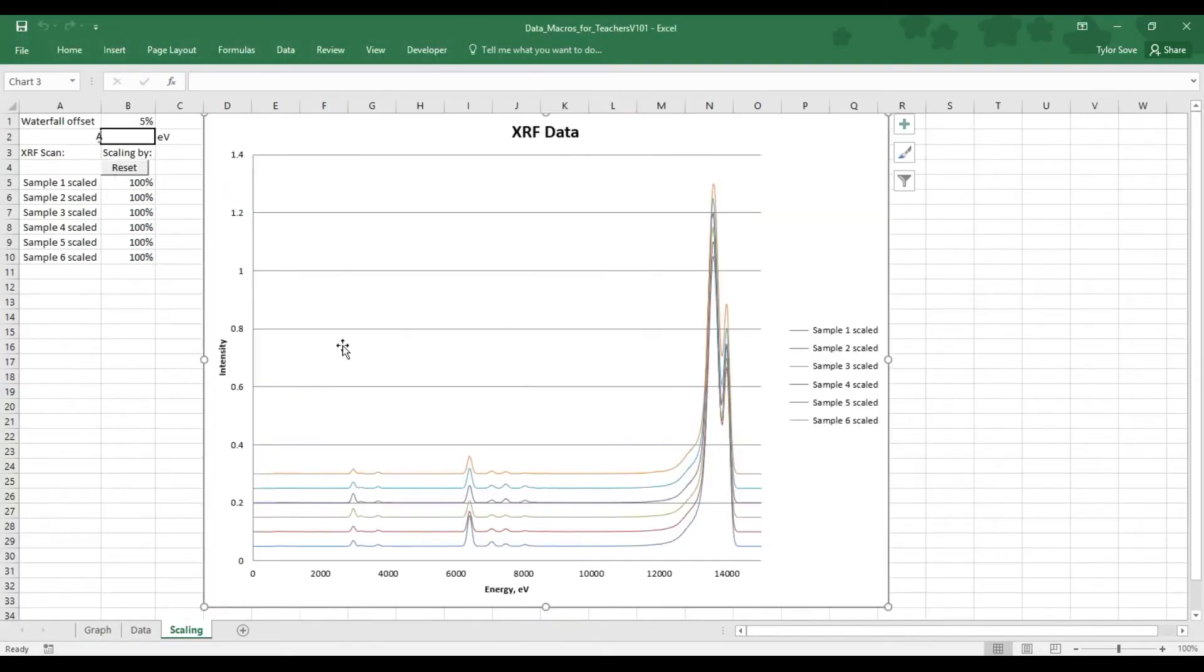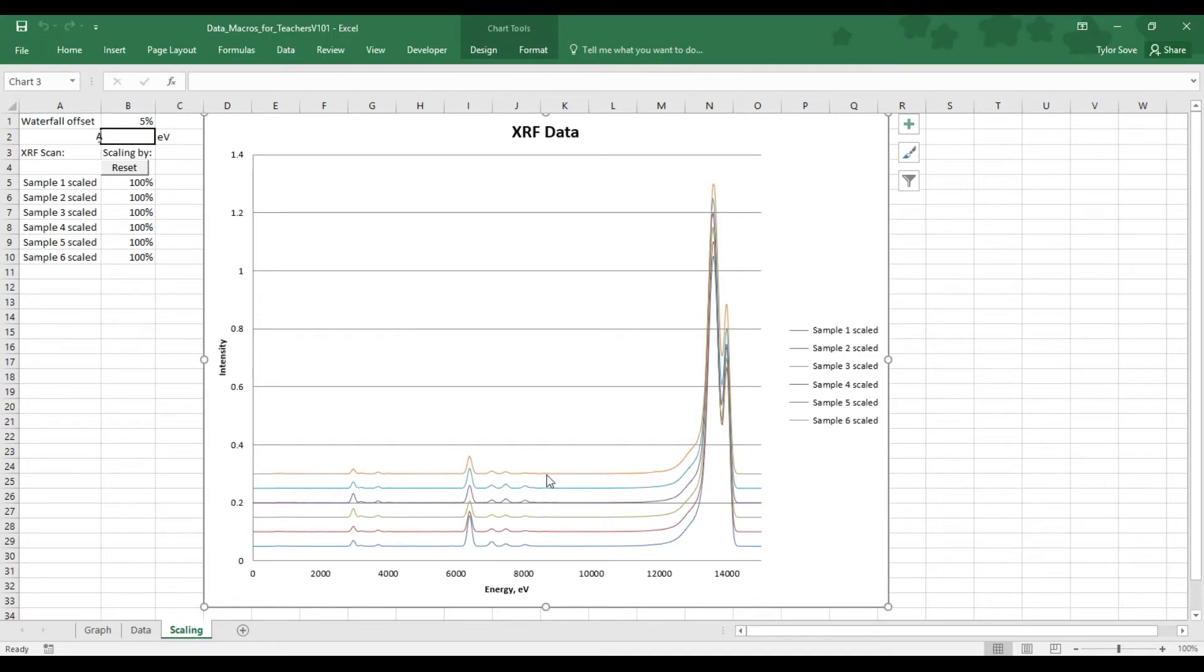The Excel file will import everything for you and present you with a waterfall graph. Now a waterfall graph is a graph that has normalized the data to range everywhere between 0 and 1, it has been scaled, and it has been offset.